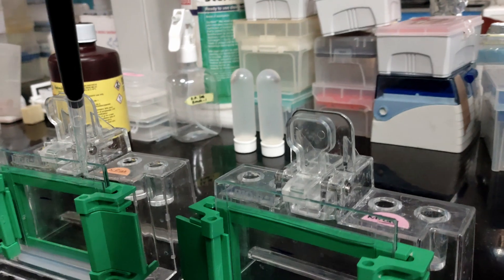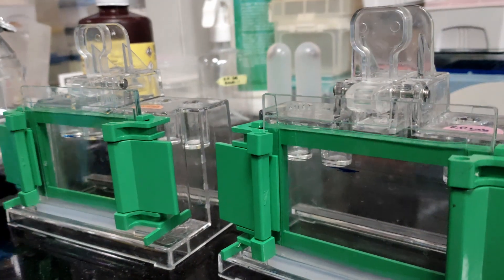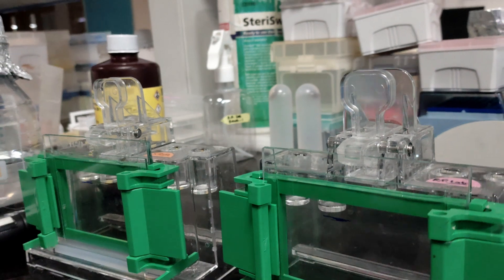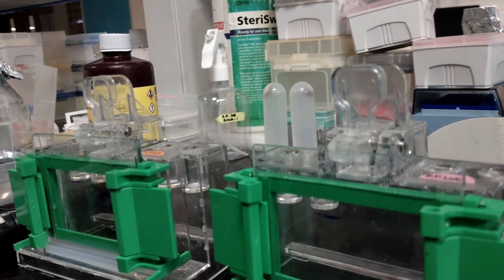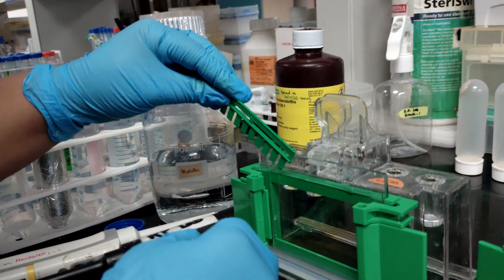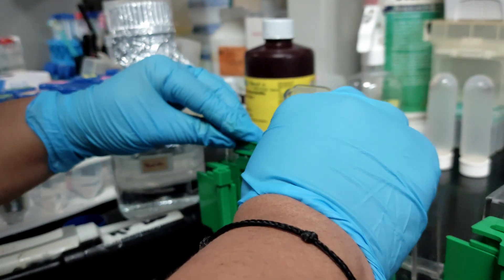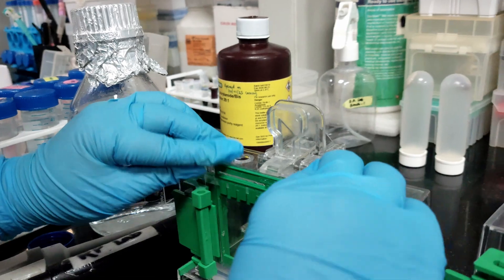Always make sure to add TEMED just before loading. I am trying not to overfill the stacking gel, as that might cause spillage. Now we will place our comb. Two different sizes of comb come with the setup — a 14-well and a 10-well. I am using the 10-well comb, sliding it on top and then pushing it inside.